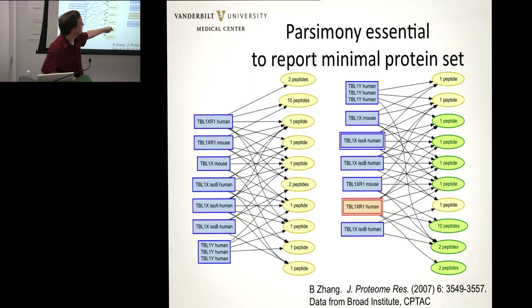So here we could have invoked all of these proteins, maybe in the 1990s, but today we've moved into the 2000s. Okay, it's actually the 2010s, but we are going to invoke just as many proteins as we must, but not one more. And this is really where the concept of parsimony comes into play. Don't step beyond your evidence. You should really work hard to make the simplest possible protein explanation to explain all the peptides you've got. And this is where parsimony stands highest.